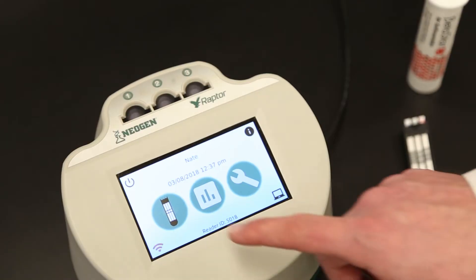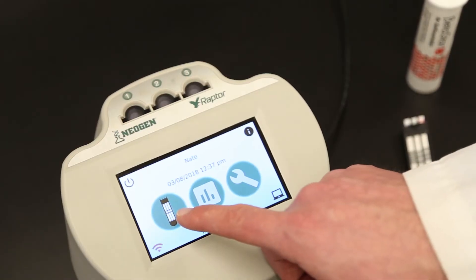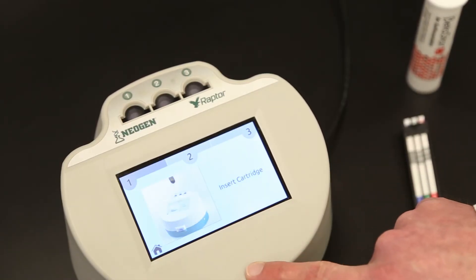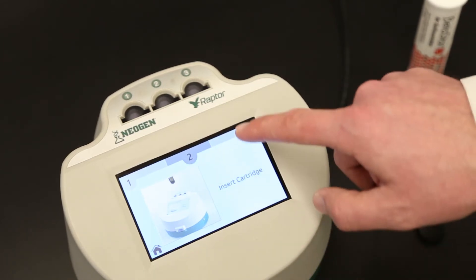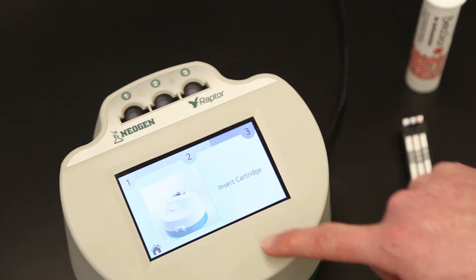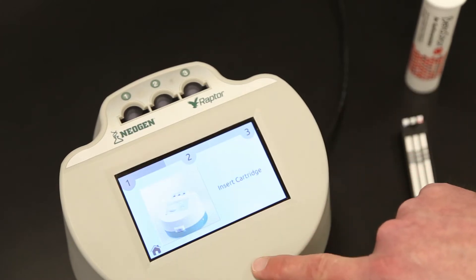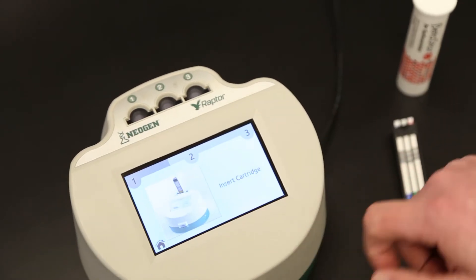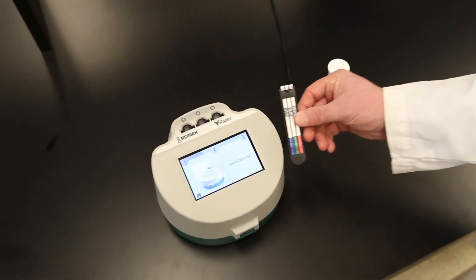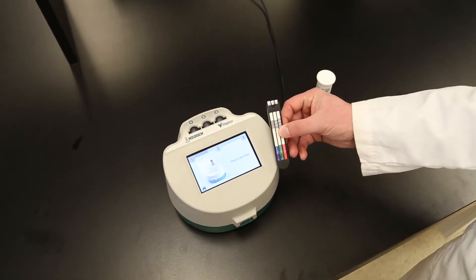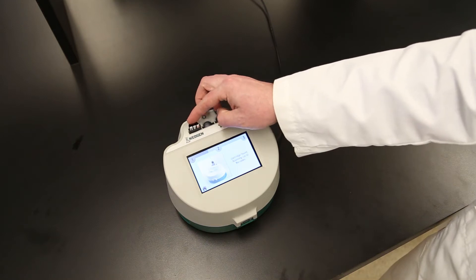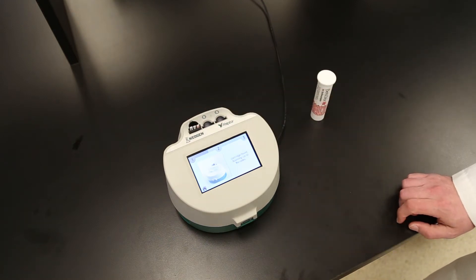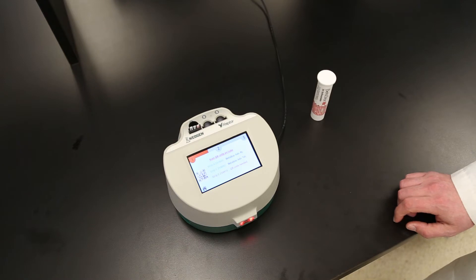The Run Test icon looks like a Raptor cartridge. Select it to enter the Test Routine screen. The numbers 1, 2, 3 display, representing each port. Each port can run independently and simultaneously. To begin, insert a Raptor cartridge containing at least one Beta Star Test Strip into any of the ports. Note that the position of the test strip within the cartridge has no bearing on performance.